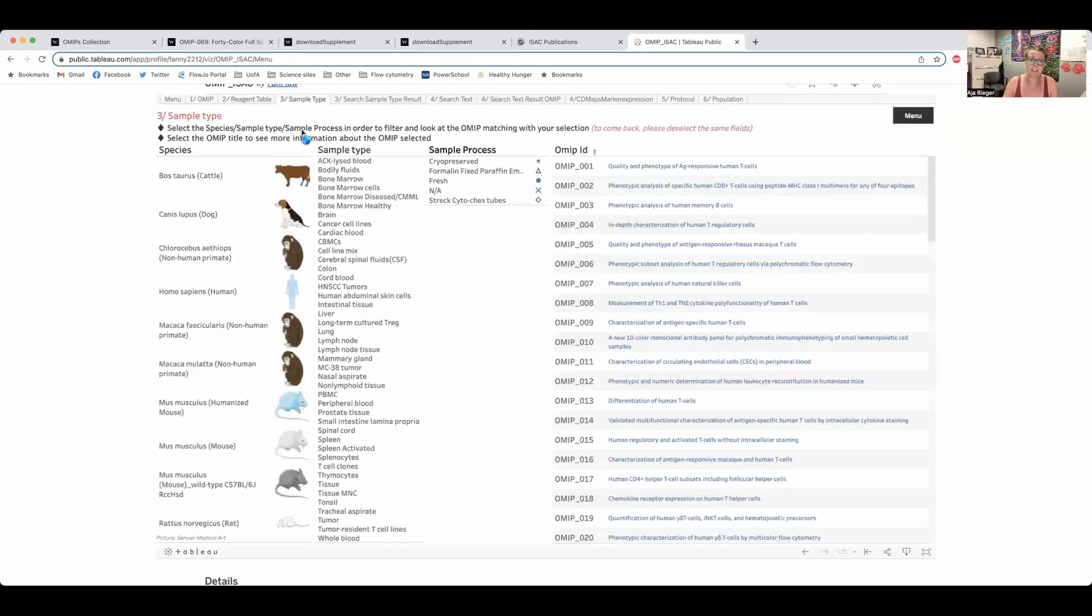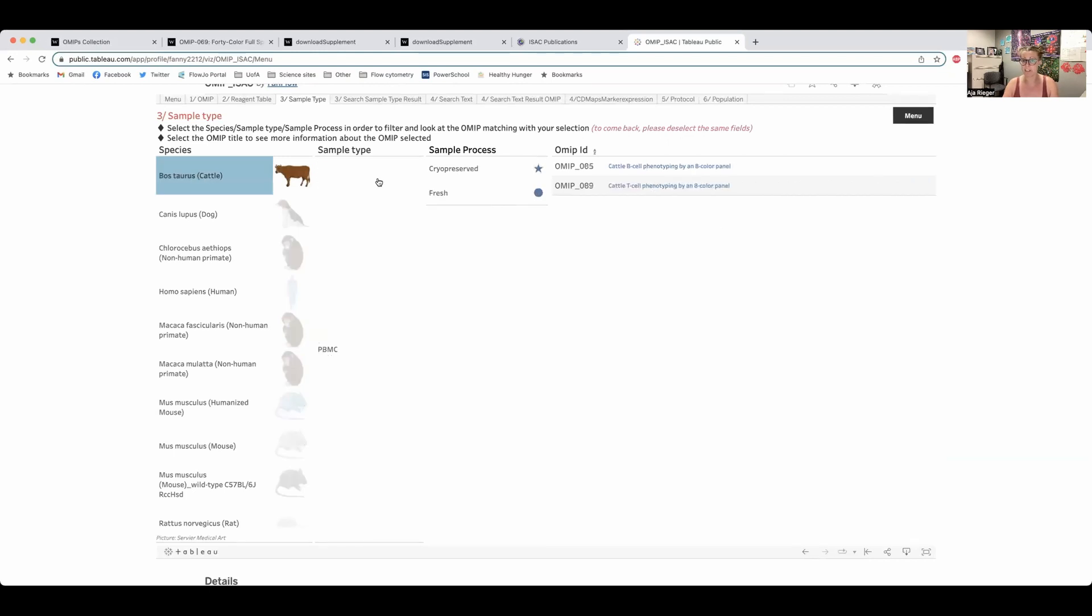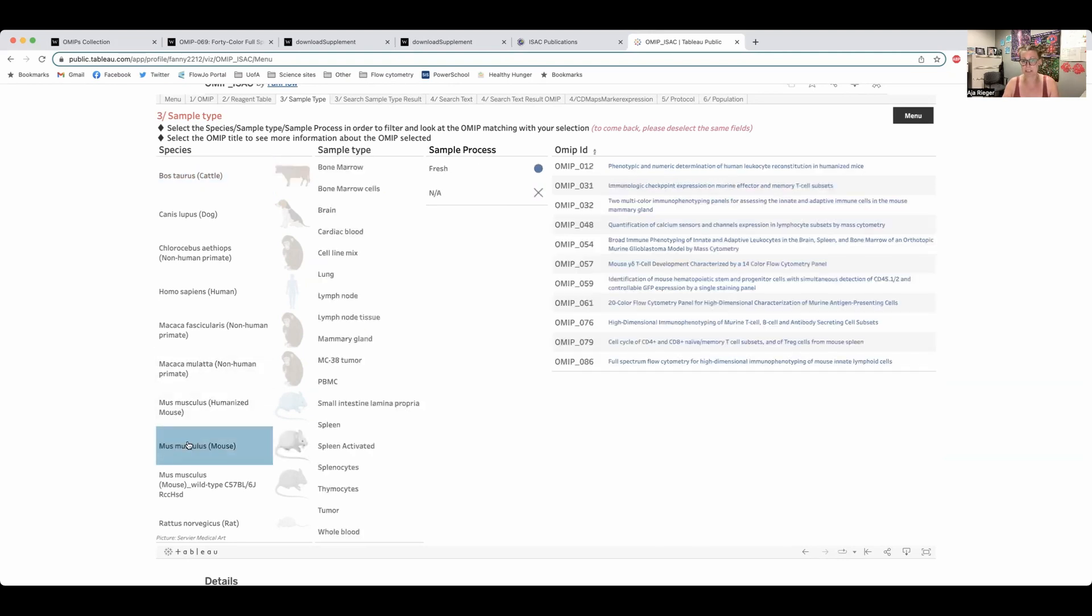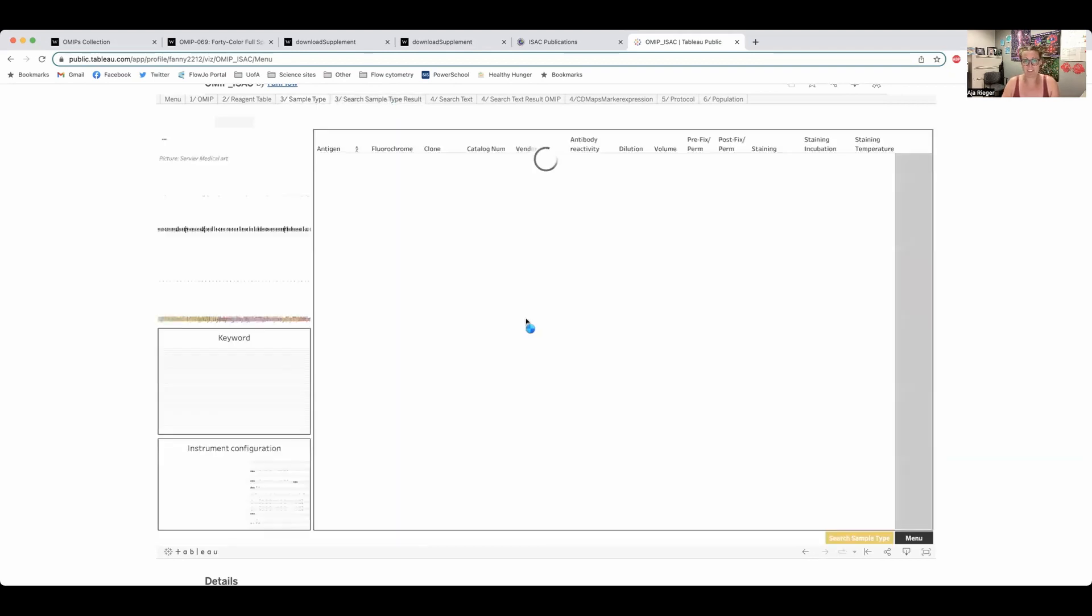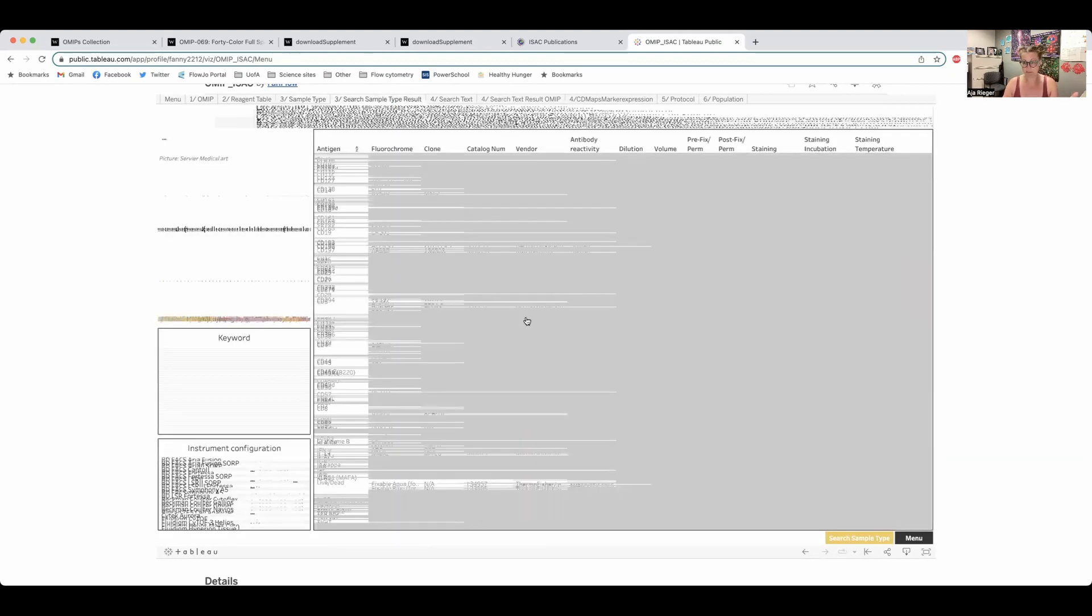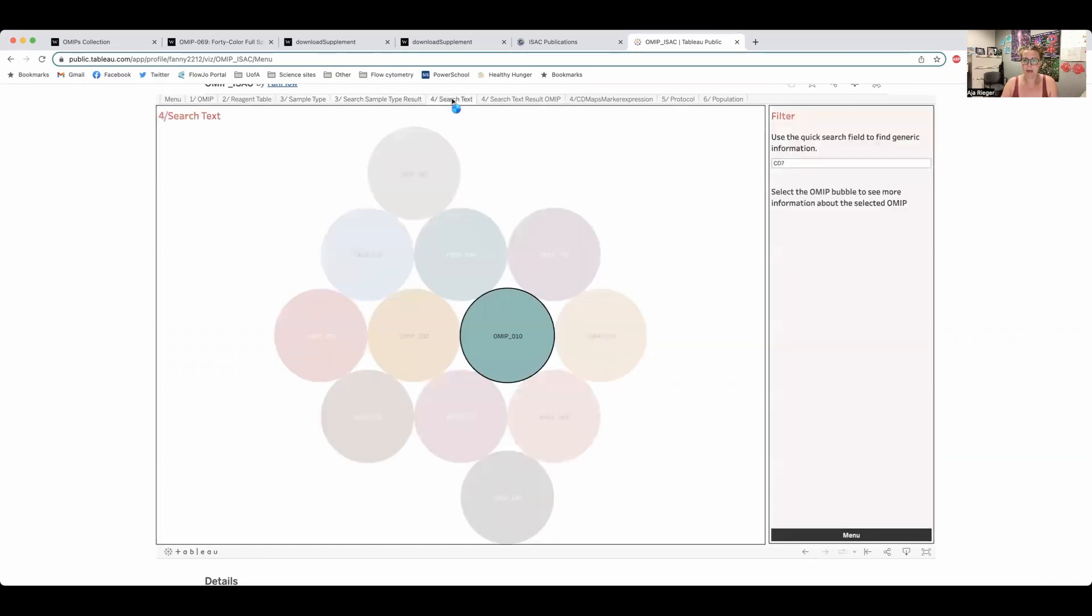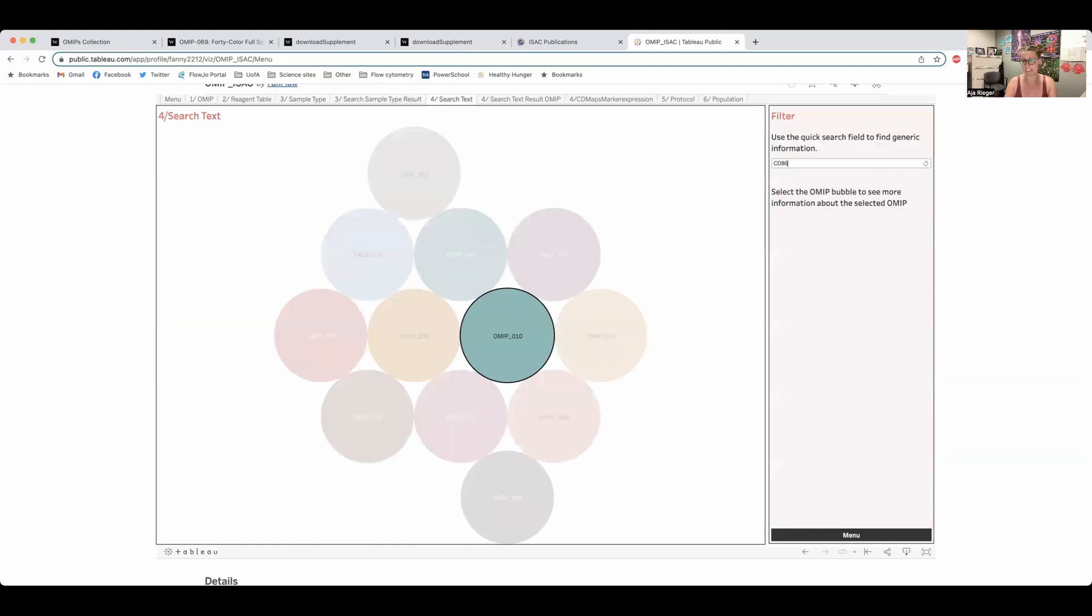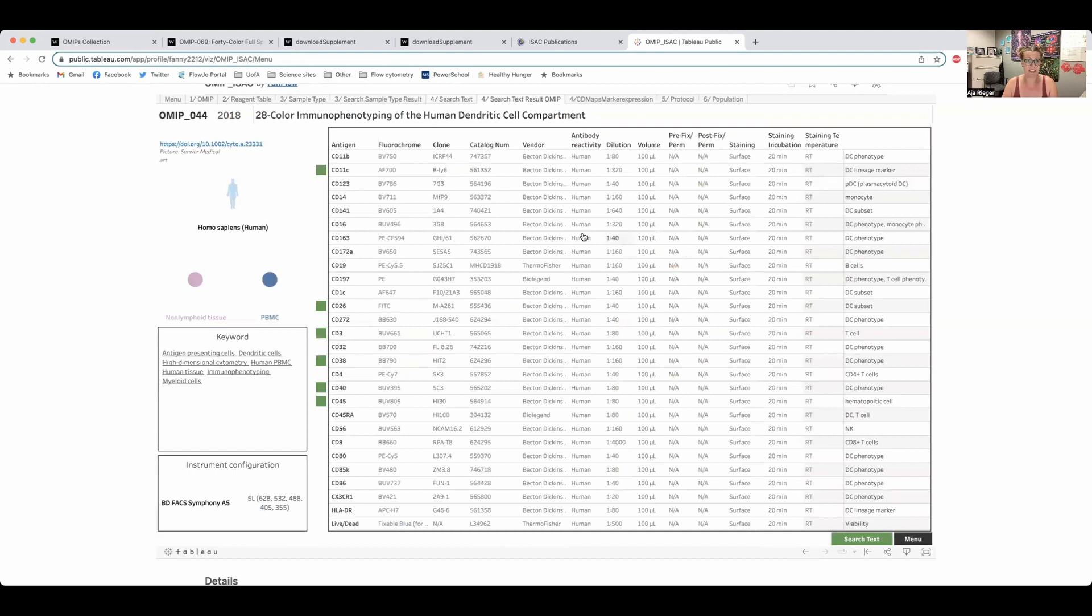Sample type is looking at the different species that OMIPs are derived from. So if you're working on cow, you can click on that one and you can find the cow immunophenotyping panels. Obviously if you're going into mice, there's going to be a lot more than with cows. Search text is really cool. If you want to quickly find some generic information, you can type it in here. So same thing if we went CD86, it will pull up the OMIPs and if we click on one of them, it will automatically take us back to this table where we can see all the details from that OMIP.